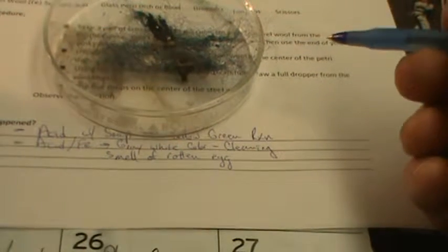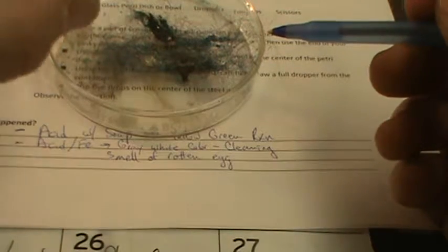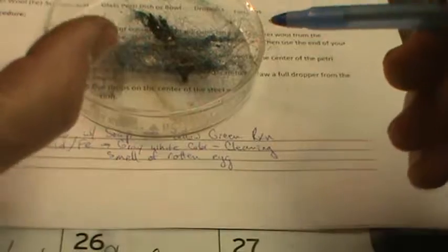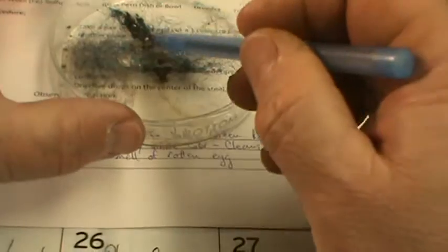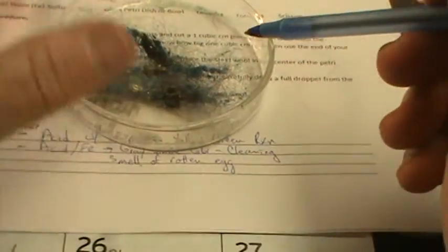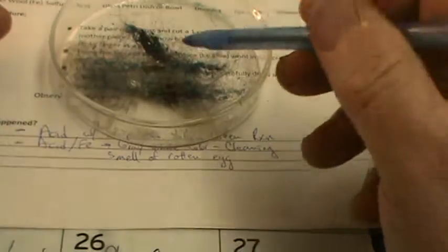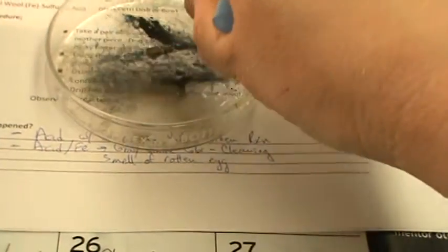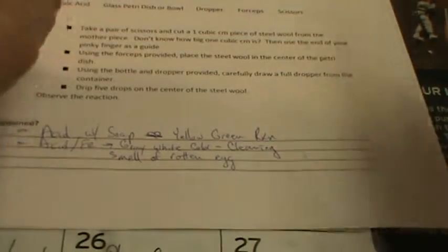Now you can go to YouTube and type in steel wool and sulfuric acid, and they'll show you a video where they put this big wad of Brillo pad in there and it dissolves away into nothing. You guys, I did this last night when I was trying to get the video to work, and this has not dissolved, and it's in acid. I suppose if I had it covered in acid it would dissolve, but just dropping some on it is not really doing anything to it that I can see other than cleaning it really well and giving us the smell. So that's what happened there, and whoa, just caught the smell.